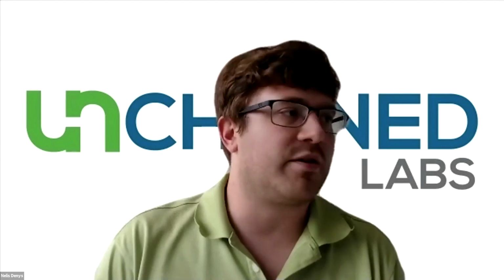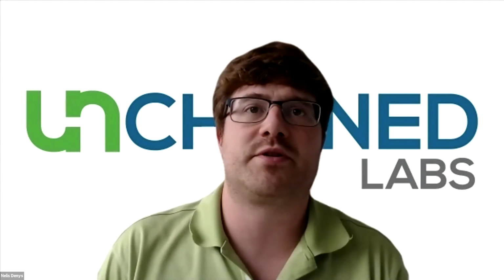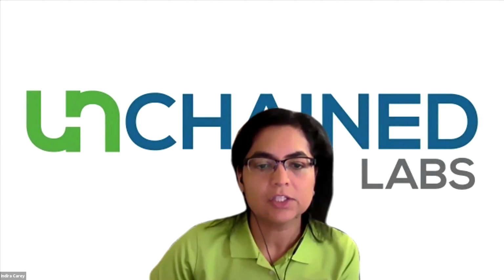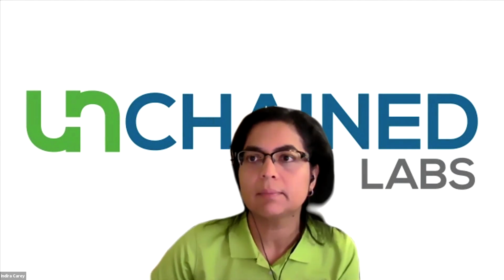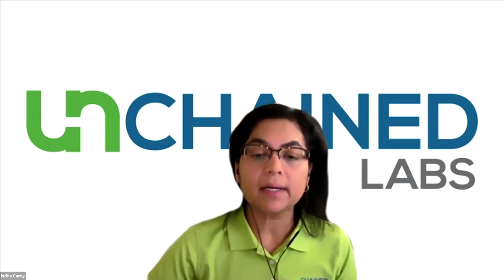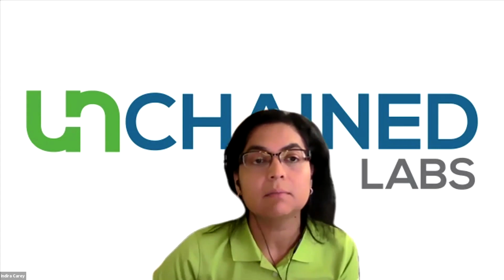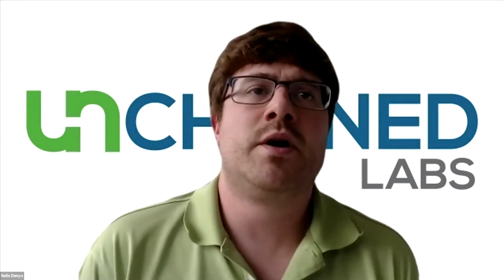So Indira, the first question, can you clarify the measurement range for double-stranded DNA? Sure, absolutely, Nellis. So the measurement range for double-stranded DNA is 1.5 nanograms per microliter up to approximately 13.8 micrograms per microliter. Perfect, good question. Thank you.